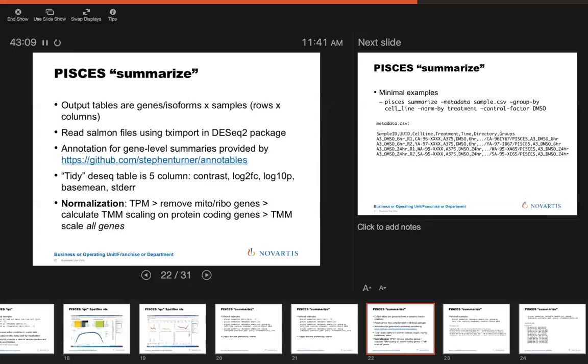In addition, xenograft samples. The way I handle xenografts is that I build a transcriptome index that includes all human and mouse genes. Salmon quantifies all of the genes, but then you have TPM, transcripts per million, for both human and mouse transcriptomes combined. If you want to compare only the human portion to another sample that's the same cell line, but grown as a cell line, not a xenograft, you have to rescale all of the human genes from the xenograft back up to 1 million, and then normalize all the samples together.